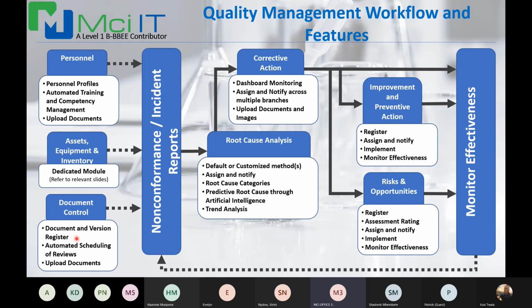I can again upload the hard copy for each version, so it's readily accessible to any system user, and I can also schedule reviews for the relevant documents. So it's less applicable in other organizations, more so in laboratories. But laboratories, for instance, have to define how often certain documents, policies and procedures are reviewed. So I can, for each of those, indicate this needs to be reviewed every 18 months. And then the system would schedule that review. If the review is concluded, it automatically schedules the new review. And then, yes, as I mentioned, you can upload each of the hard copies of the version as well.